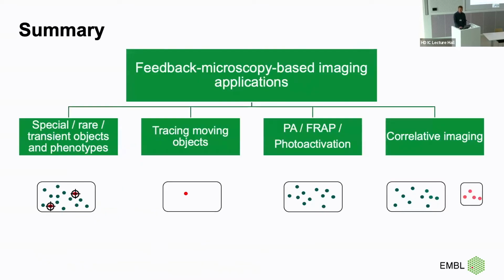All right, so just to begin with, I want to highlight the applications which I will talk about in the beginning, and these are the type of applications which I would call imaging applications. So first of all, as in the first example, we have targeted imaging, right? We want to have specific objects, and we want to focus on them and maybe acquire them at high resolution. Then another important part of applications is where we want to track the object over time, right? The object can be moving, and we already had an example today during the first session, and I'm pretty sure that we will hear more later.